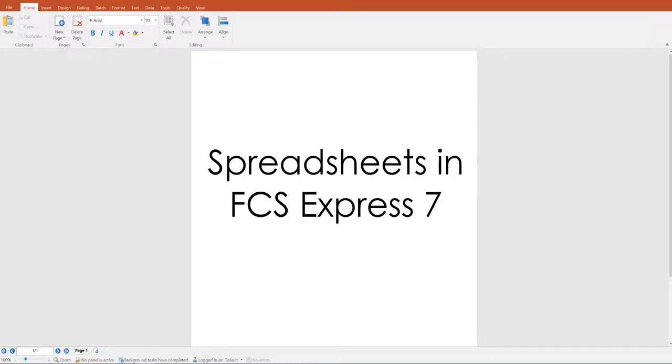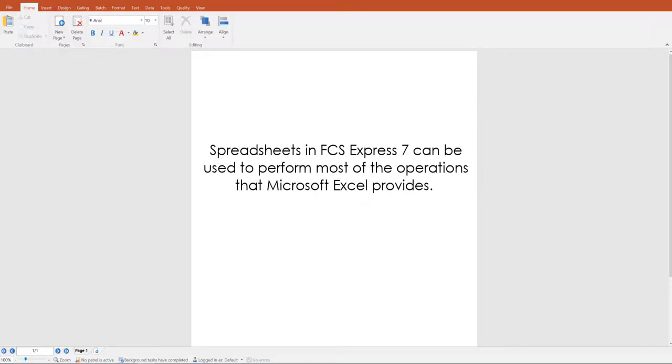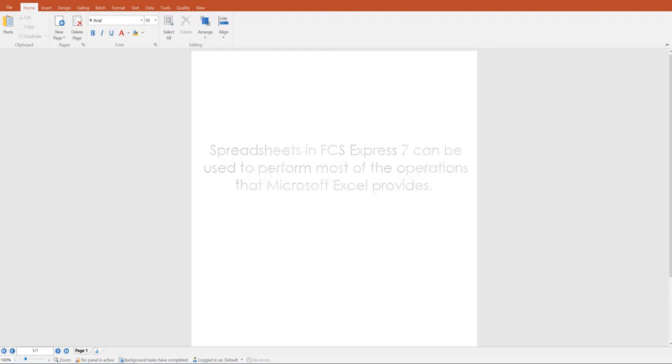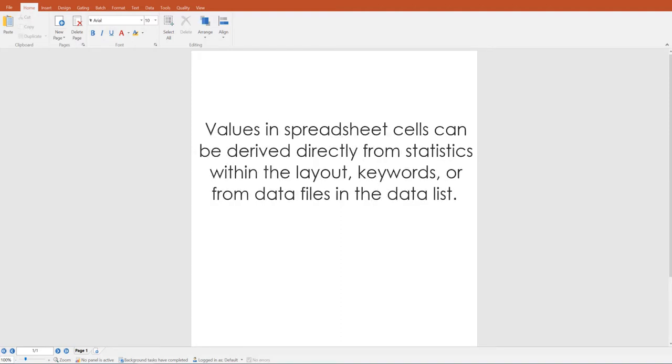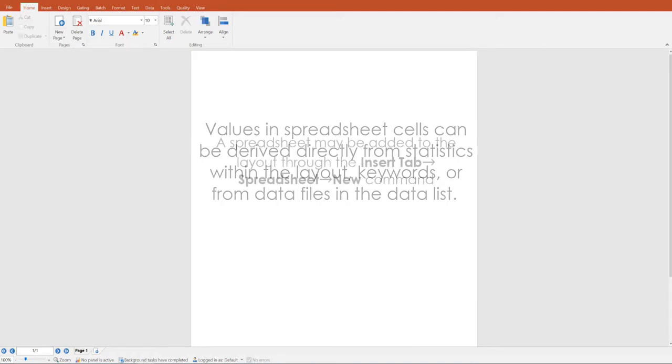Spreadsheets in FCS Express can be used to perform most of the operations that Microsoft Excel provides. In addition, values in spreadsheet cells can be derived directly from statistics within the layout, keywords, or from data files in the data list.